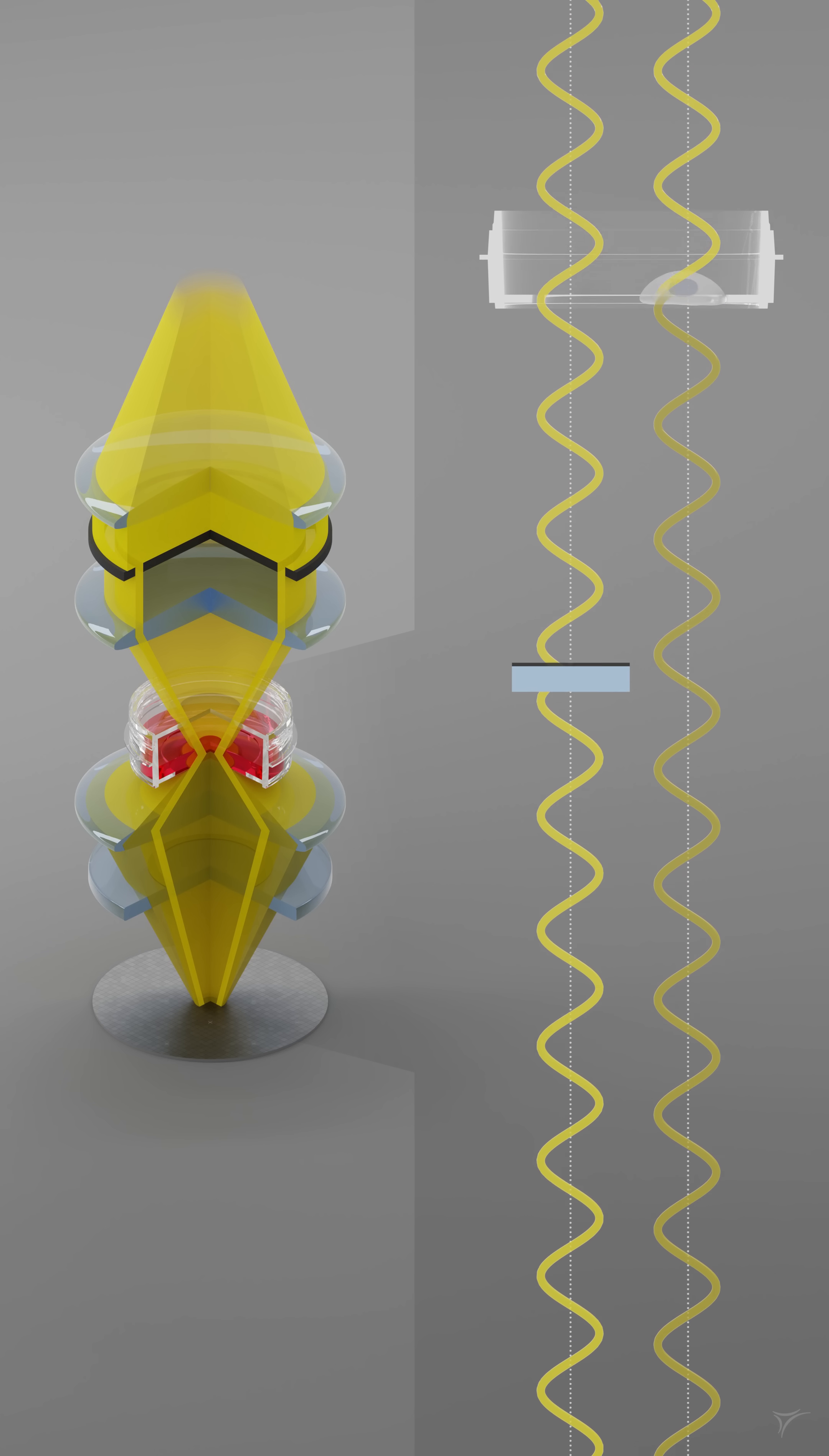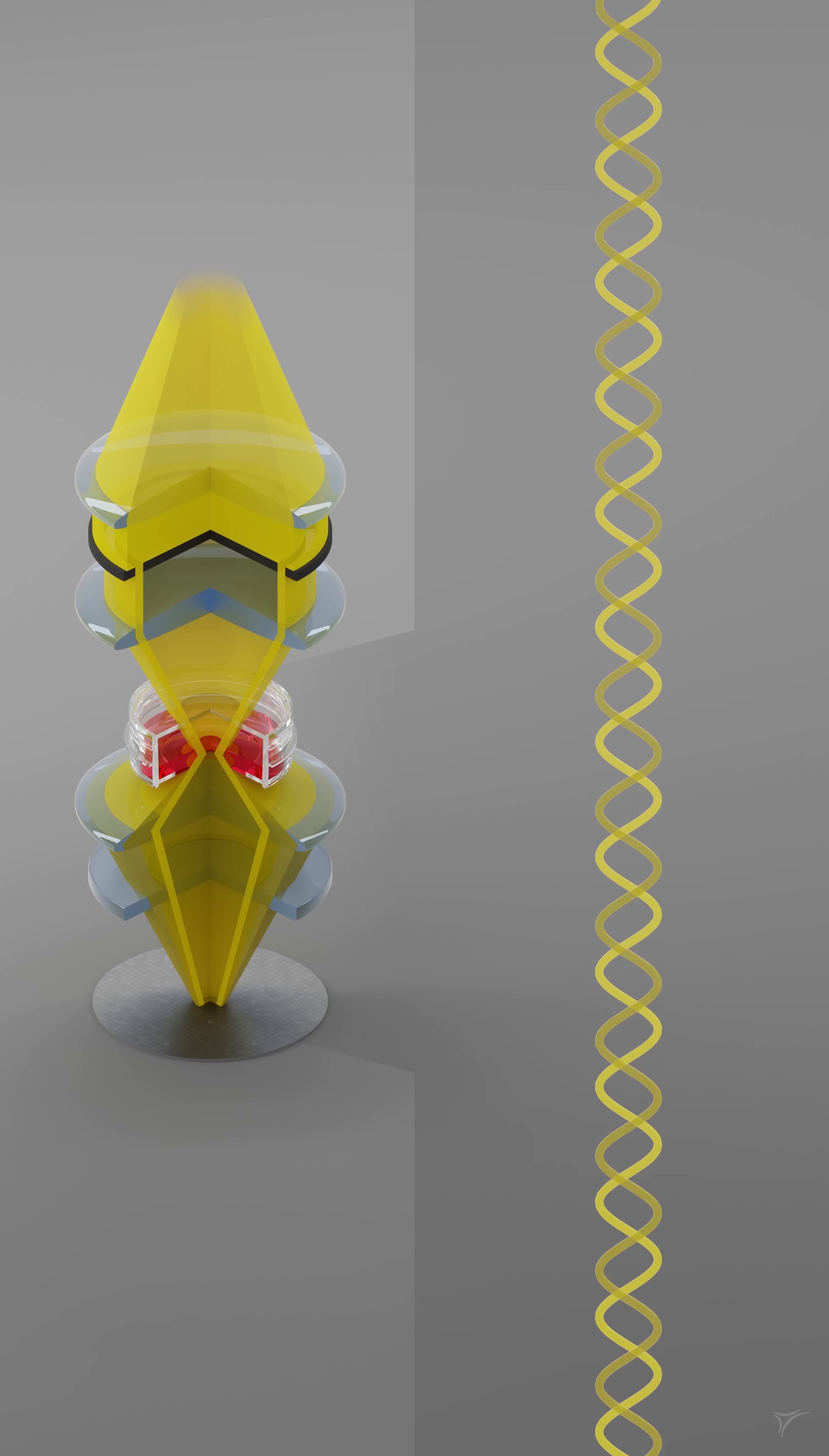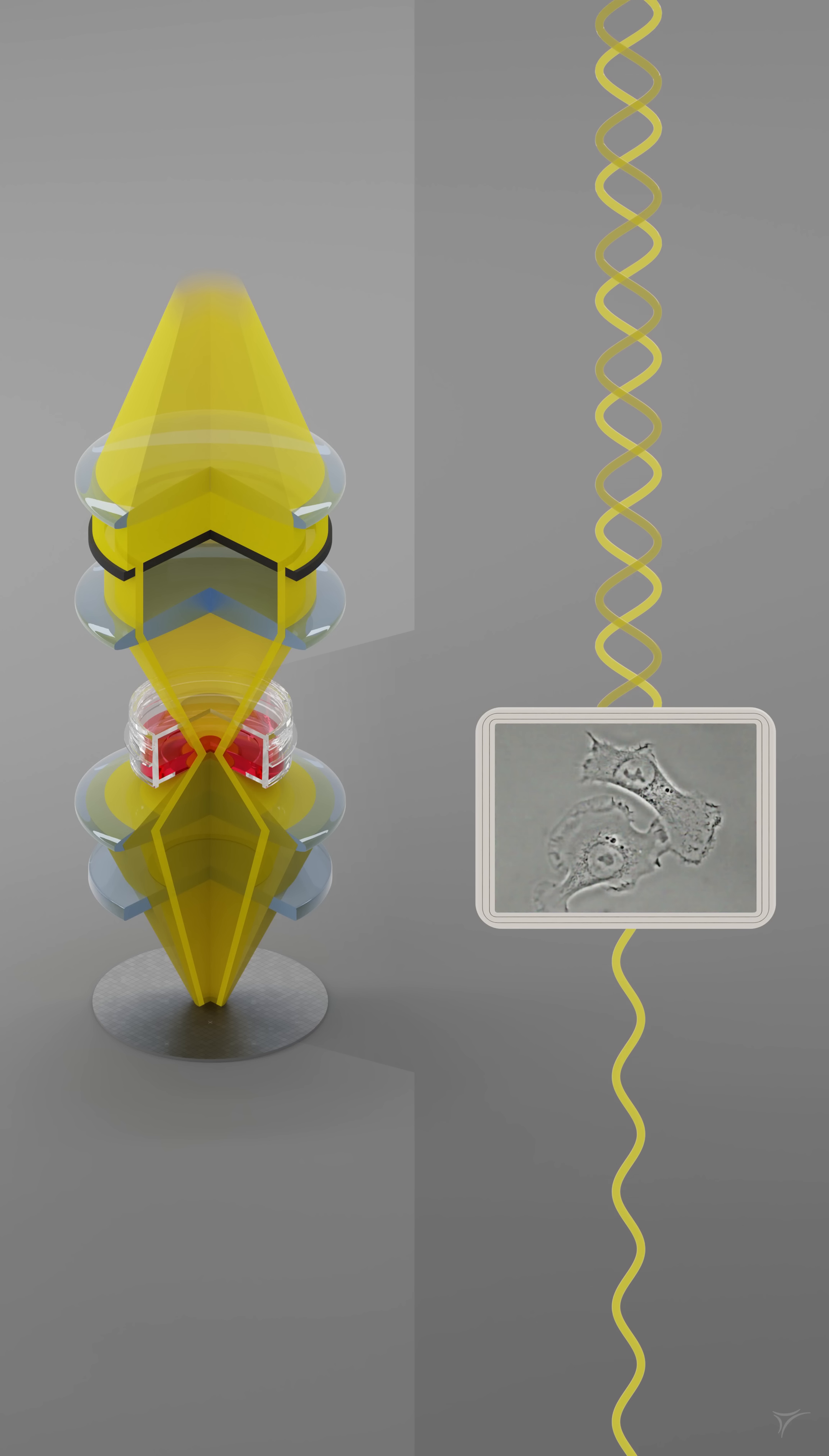Now, the light passing through the phase ring with defined phase shift interferes with the light coming from the sample, creating an interference pattern. This interference pattern leads to an altered amplitude and, by this, to an increase in contrast, making the non-pigmented cells clearly visible.